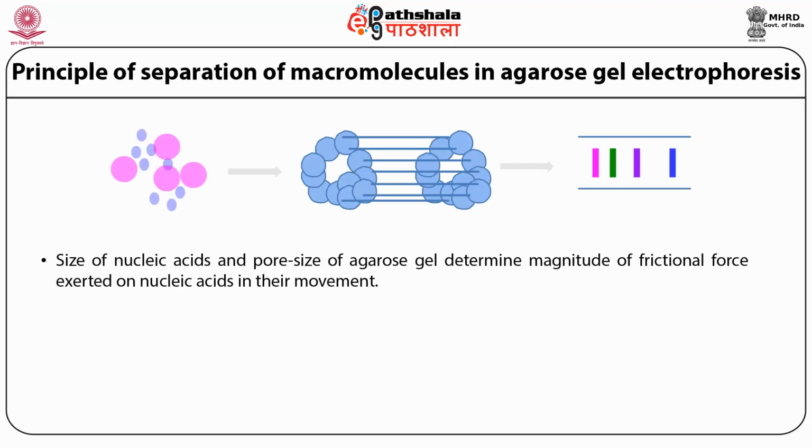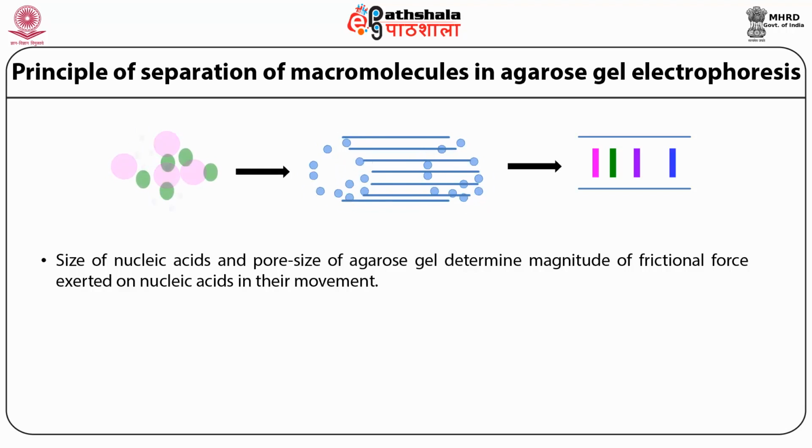Size of nucleic acid and size of the pore in gel determine magnitude of frictional force exerted on nucleic acids in their movement. This situation is similar to SDS-PAGE.